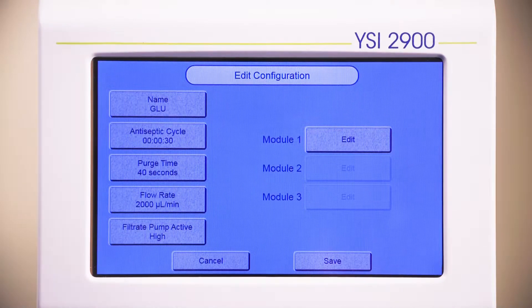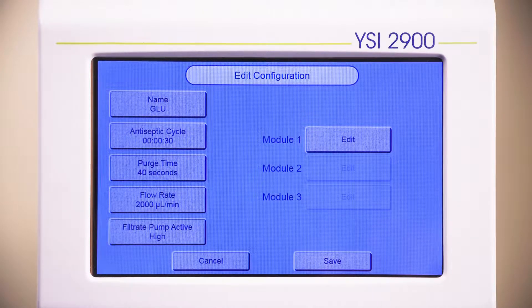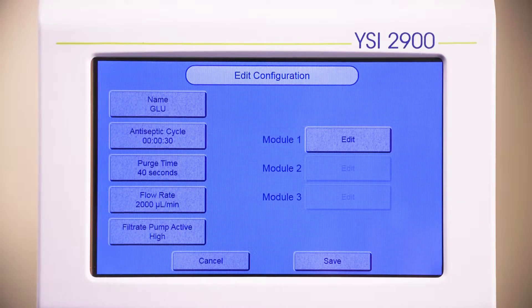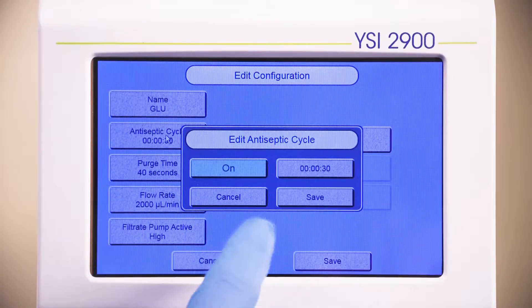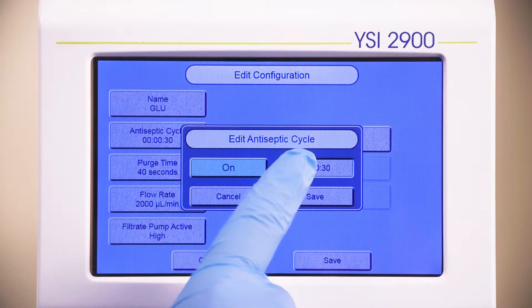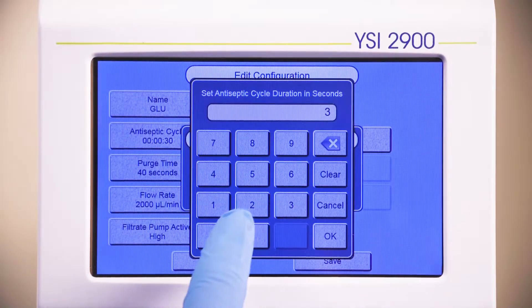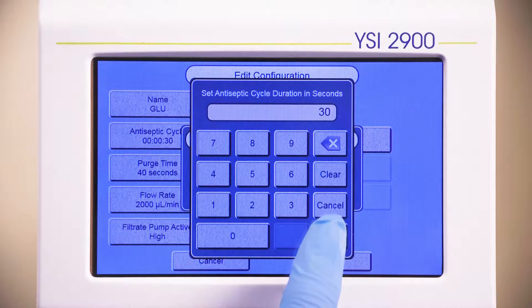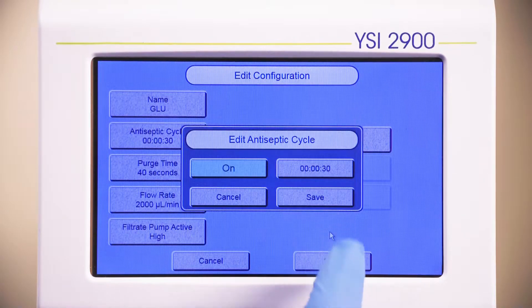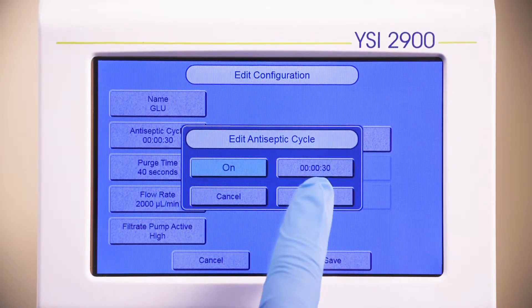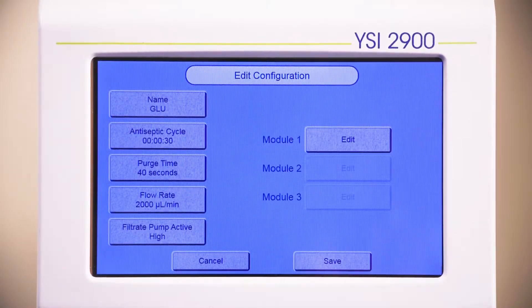On the left-hand side of the screen, the antiseptic cycle defines the time that the pump will run, pumping antiseptic through the lines. The default setting is 30 seconds. This is adequate if the antiseptic solution, the bioreactor, and the analyzer are all side by side on the bench. This setting can be increased if you would like the pump to run longer.